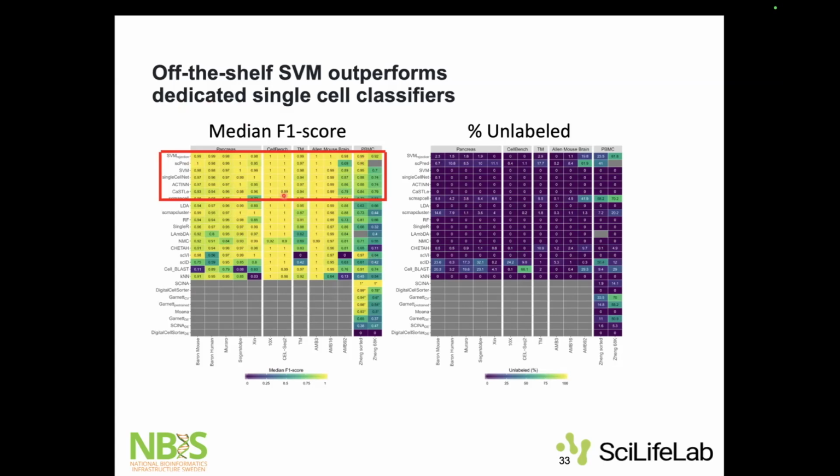And we also understood here that the complexity of the data is important. Algorithms perform differently when the complexity changes. And the complexity is not only based on the number of cell types, it's the number of cell types and also how far away the cell types are from each other. A data set that has maybe 80 cell types, but they are very distinct, might have lower complexity than a data set that has 6-7 cell types, but with so many overlaps between them. So that should also be considered here.